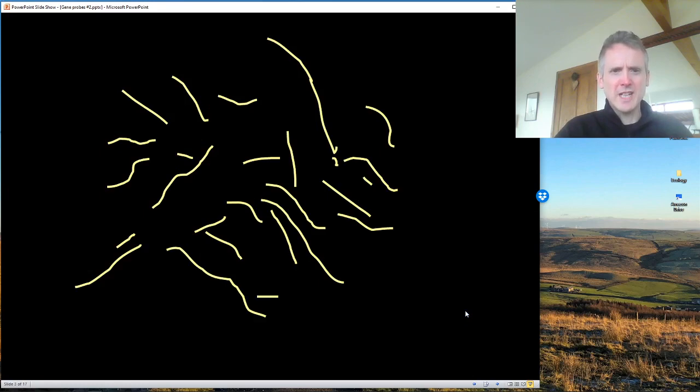Can you think of an enzyme that I can use that will cut the DNA into fragments? Some kind of enzyme we've met previously. Yeah, chopping those phosphodiester bonds. Maybe a restriction endonuclease. That's exactly what we use. So it's cut into pieces, and here you can see that I've got a random arrangement of sizes.